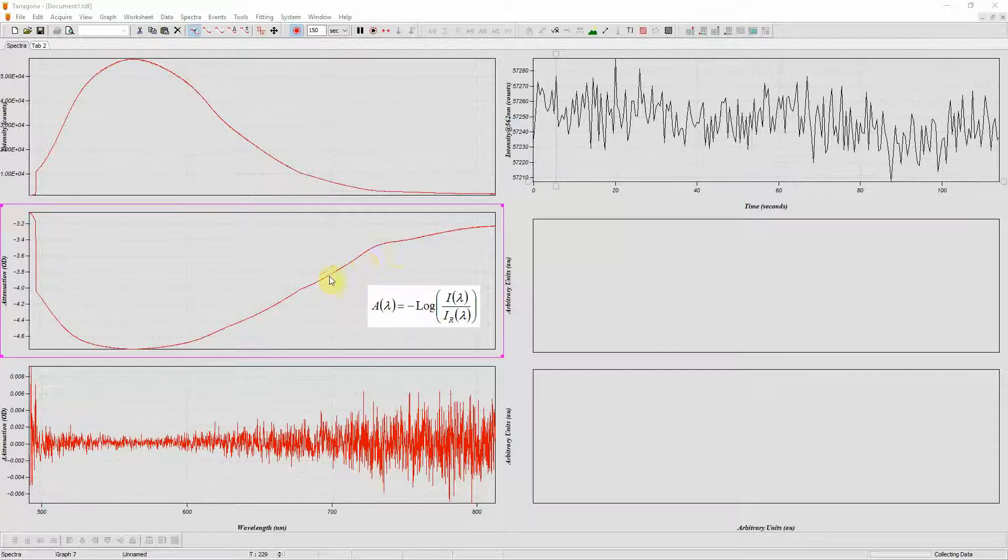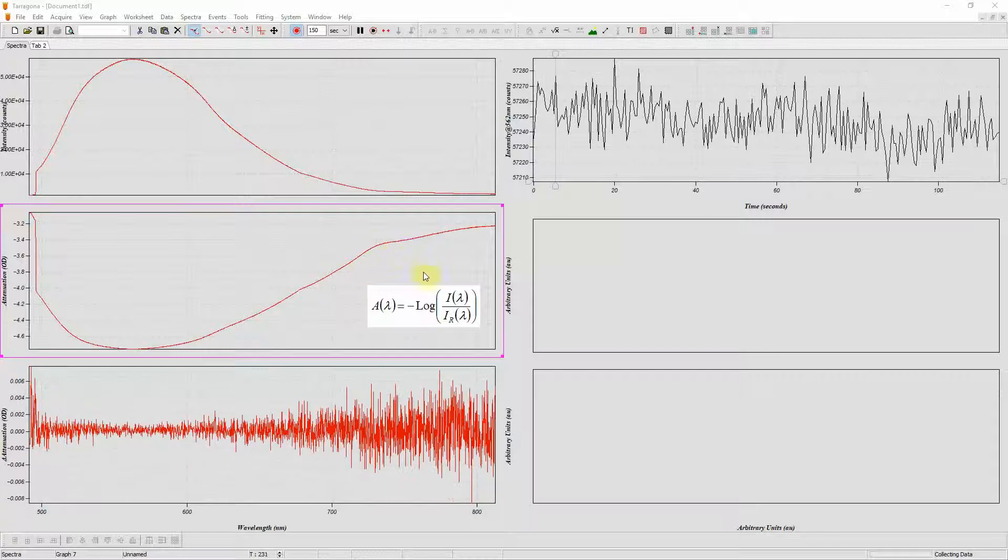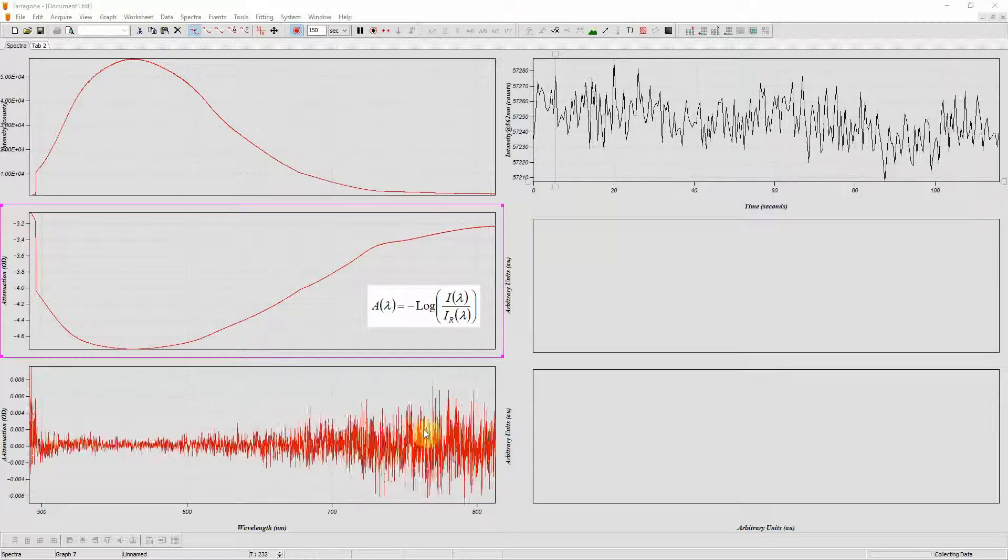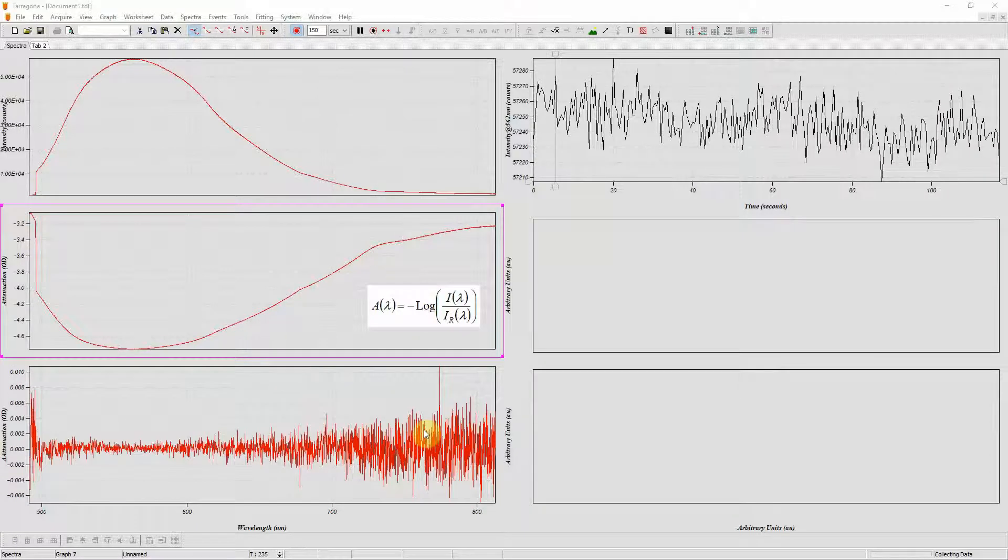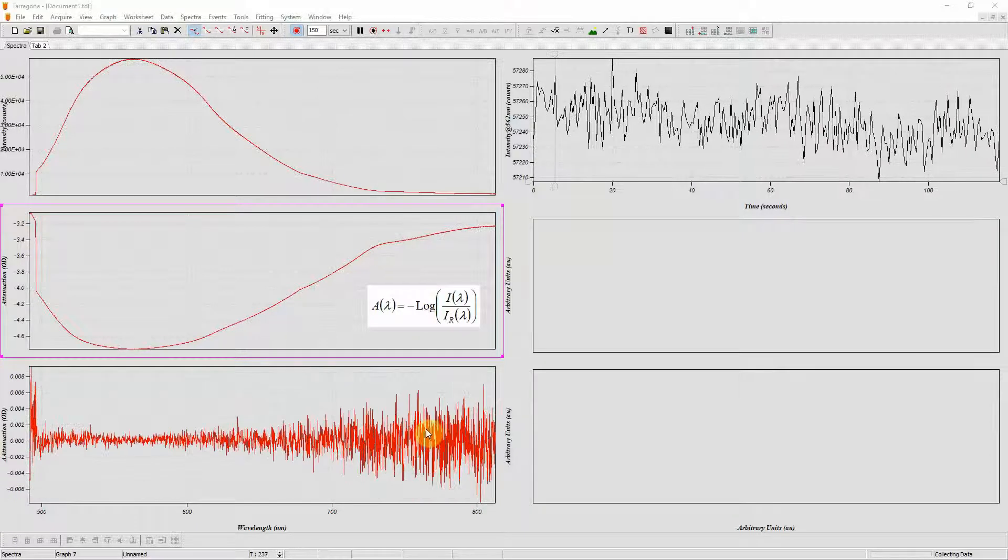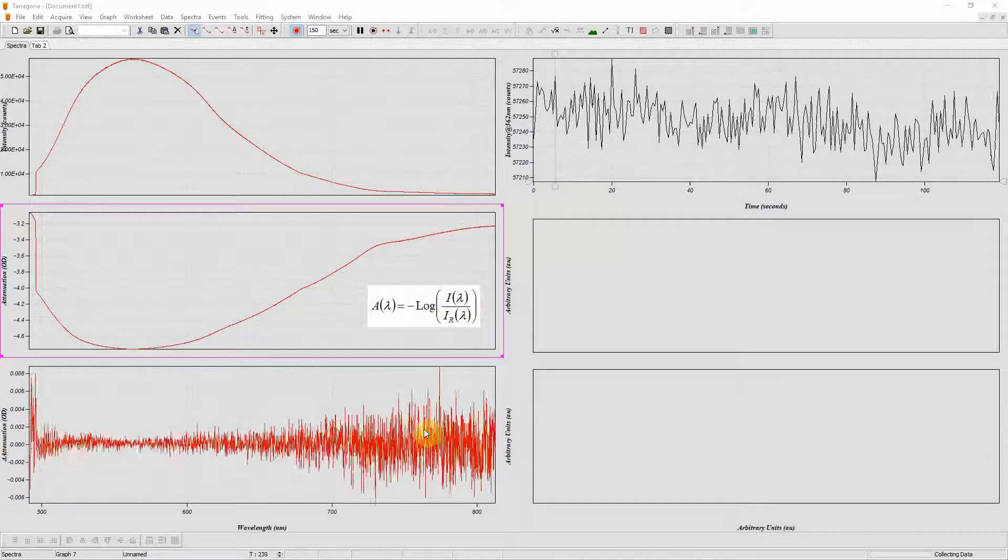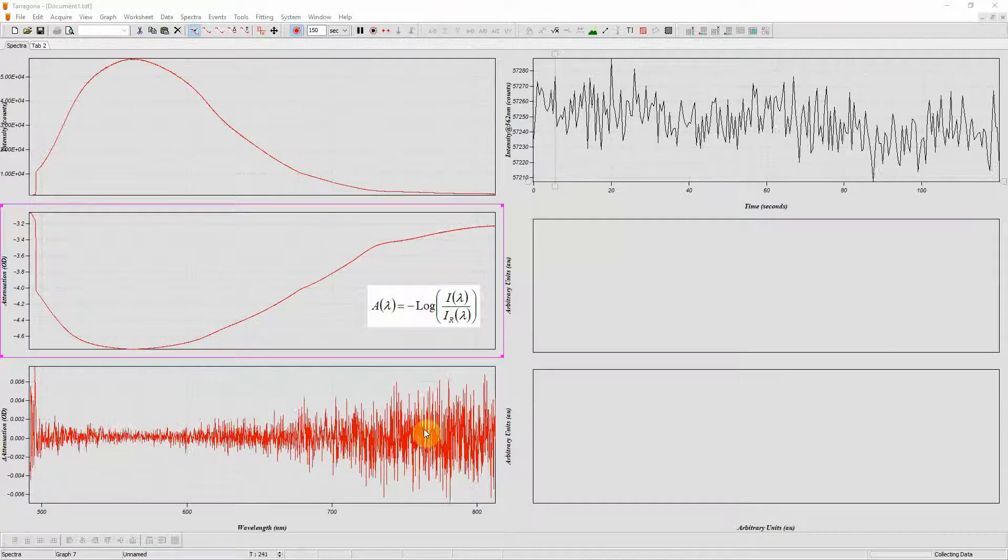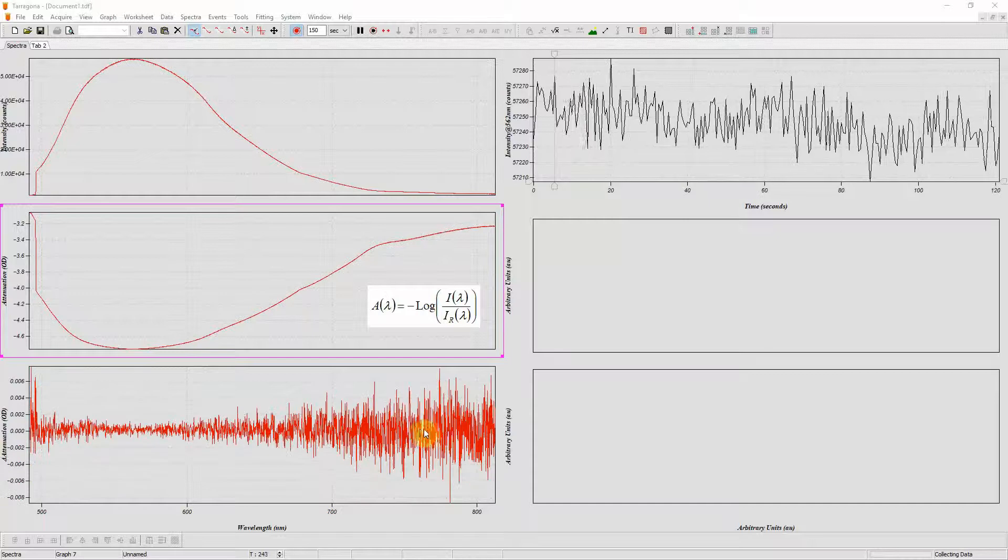In this graph I have the attenuation spectrum and in this I have the change in attenuation which is defined as the change in attenuation for my first spectrum I collect.